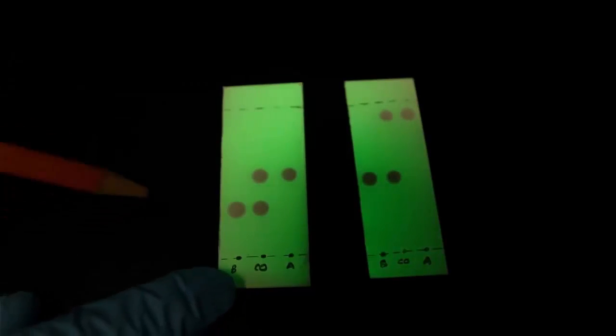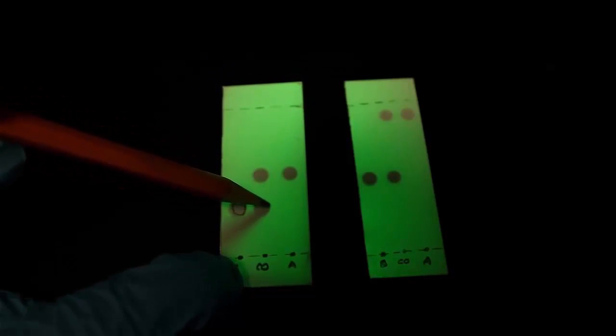Once your TLC plate has dried, place it under UV light and circle all markings with a pencil. Never look directly into the UV light because it will likely damage your eyes.